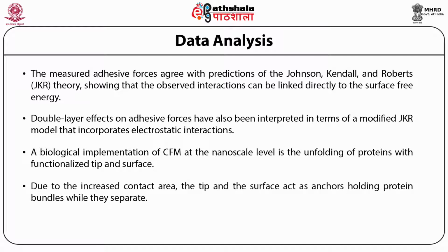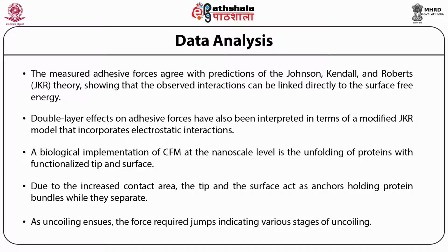Due to the increased contact area, the tip and the surface act as anchors holding protein bundles while they separate. As uncoiling ensues, the force required jumps, indicating various stages of uncoiling.